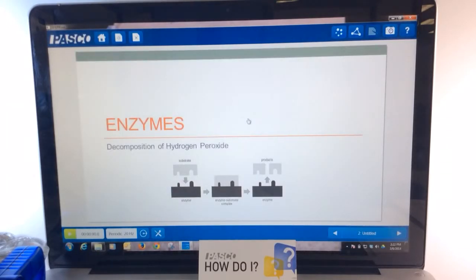So now I've provided a template page with some information to the students, such as the topic of the lab.